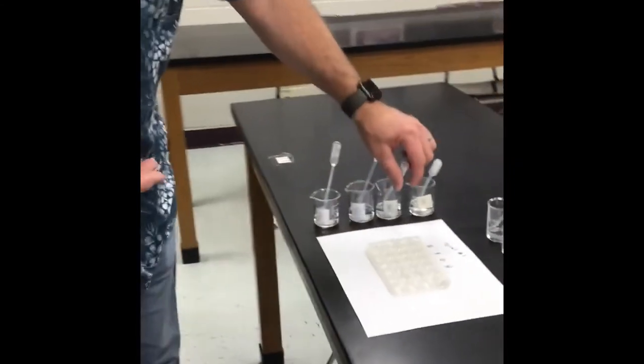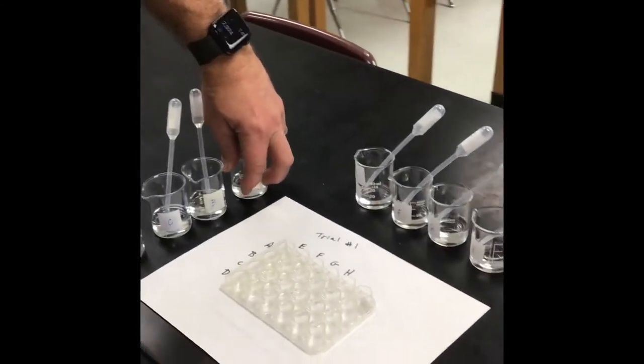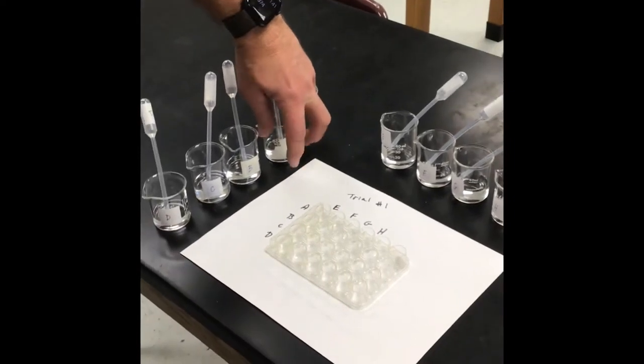And so what I do is I have them set up here. We've got to try to figure out which one is which. So what I'm going to do is 3 different trials of these drop-wise and let you kind of try to figure it out. This is one of the hardest things for kids to figure out, but maybe you'll be able to figure it out.